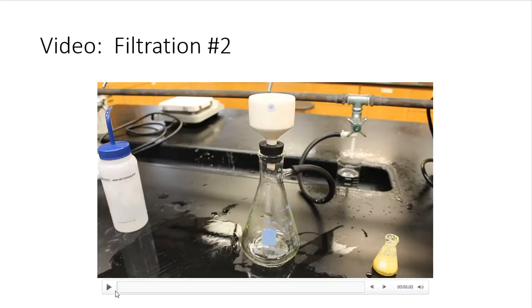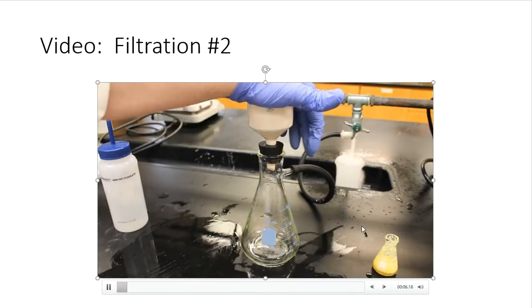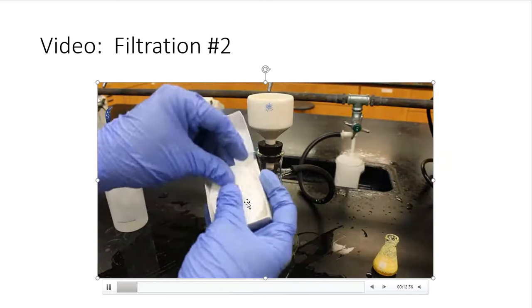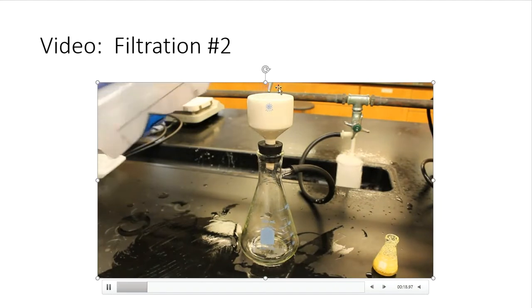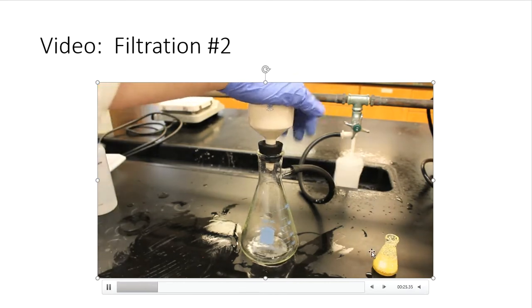Well, I'm going to do the same thing to number 2, folks. I mean, there's no difference here. It's all the same procedure. It's all the same step. So here is, and I'm going to turn that off so you don't have to hear it, the aspirator, and that aspirator is going to get a piece of filter paper just like the first one did. That filter paper is going to go in. I pre-wet it. That seats the filter paper onto the holes. Make sure they're all covered.